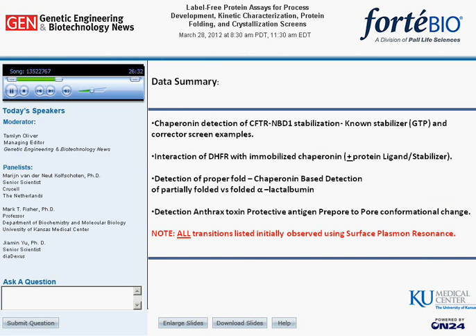Next. In the next series of data slides, we demonstrate the utility of this novel chaperone platform, where we use this system to identify potential protein binding compounds that may be stabilization candidates of the nucleotide binding domain of the cystic fibrosis transmembrane regulator, or CFTR-NBD1. This protein was generously supplied by the Cystic Fibrosis Foundation.